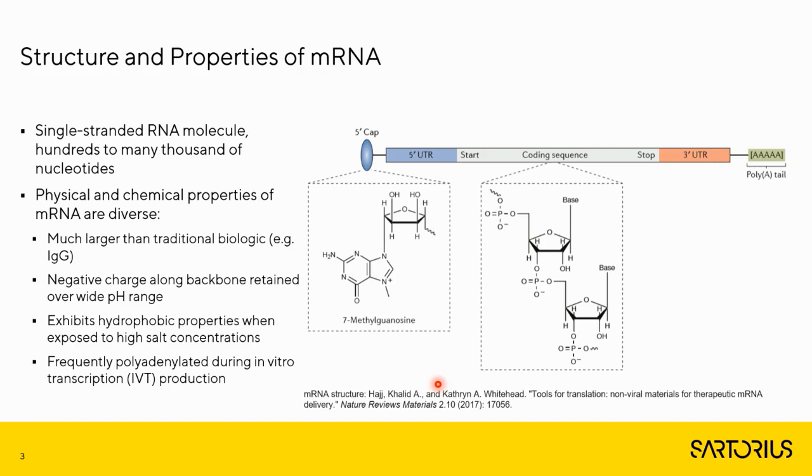But then we're more interested in the physical-chemical properties of mRNA. And there we are oftentimes surprised at how the field is still surprised by the fact that mRNA is a huge, gigantic molecule. I think it's one of the largest biopharmaceutical molecules currently available on the market.